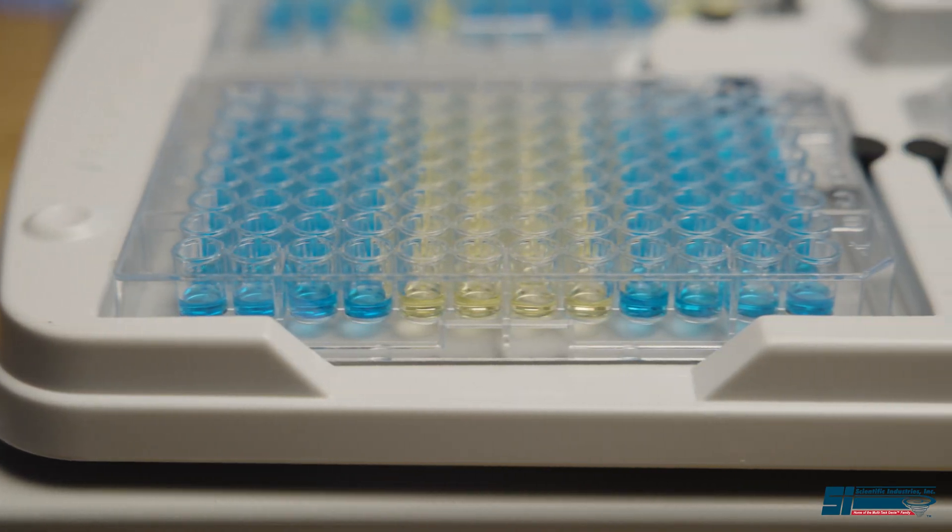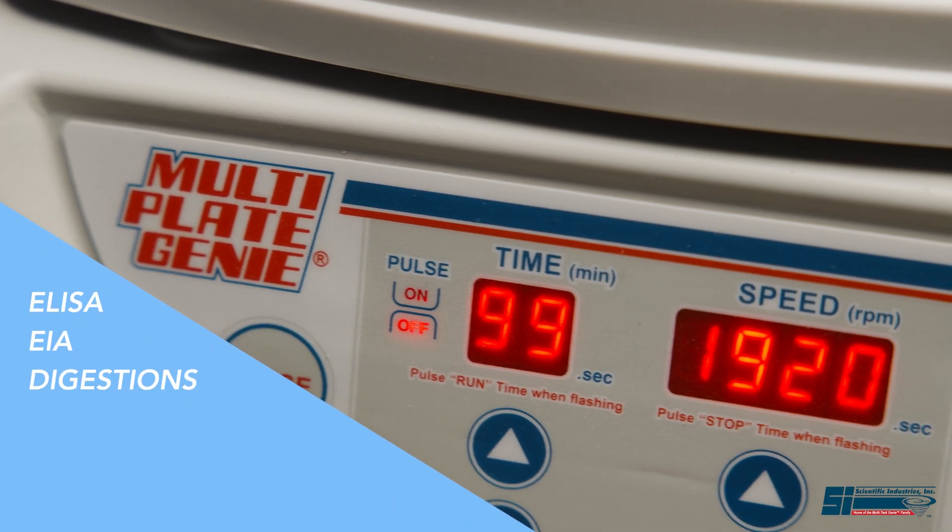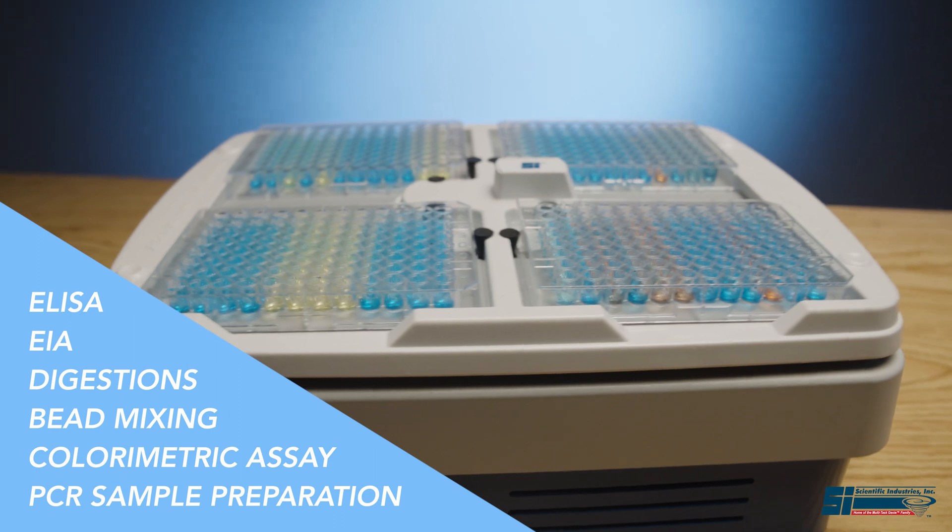Whether developing or following existing protocols, the MultiPlate Genie's design and programming features make it ideal for many MicroPlate mixing applications.